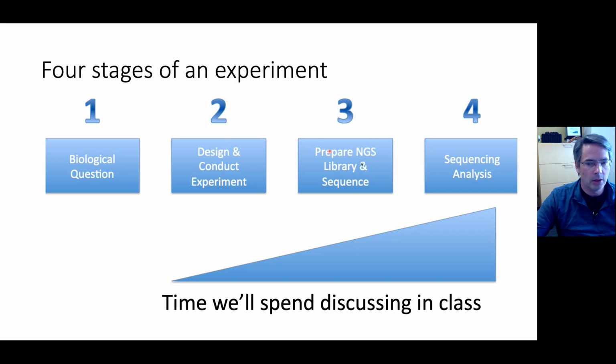That leads into, how are you going to prepare the NGS, next generation sequencing, libraries? We're going to talk about that in a few minutes. And then the sequencing, what platform are you going to use? And then number four, the analysis. Typically, number four takes the longest.